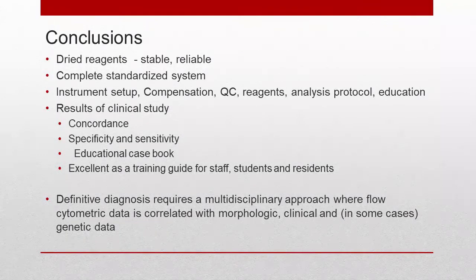But in the end, you would never use this product the way that it was set up for the study, because a definitive diagnosis really does require this multidisciplinary approach where you merge the flow cytometry data with morphological data, clinical data, and more and more frequently the genetic data that you get from the samples that you receive in the lab.